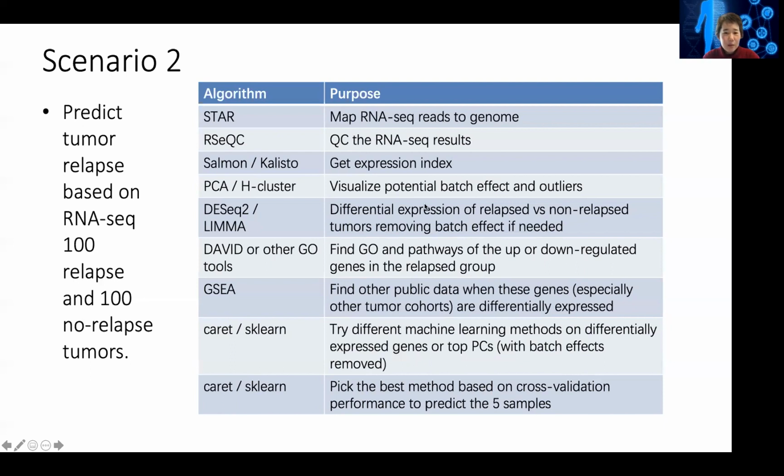And sample here would be like one library that has been sequenced, not individual reads. Yes, in this case, a sample would be one tumor or one normal, or just one RNA-seq dataset: either paired-end FASTQ in 2 FASTQ files, or if it's single-end, just one FASTQ file with all the reads for that sample.